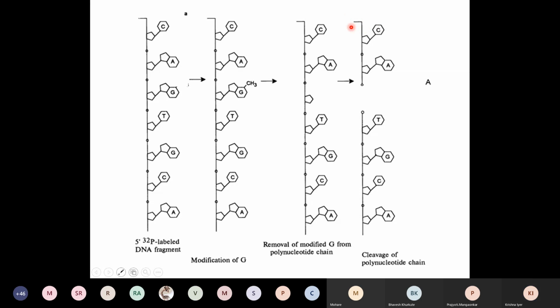Okay. Now, imagine for a moment that in another molecule, this guanine was methylated. If that were the case, what would have happened? I would have seen a methyl group here. Then it would have been depurinated here. Then it would have been cut here. And when it got cut here, what I would have found is a piece which was C, A, G, and T, which is still radioactive. And these 2 things would have disappeared and not be traceable.